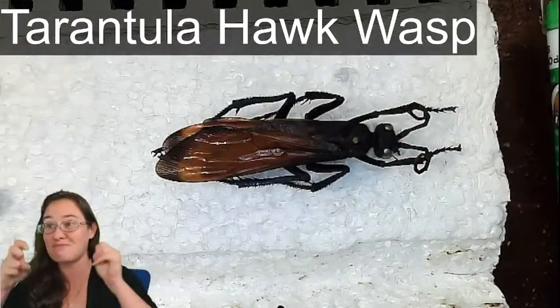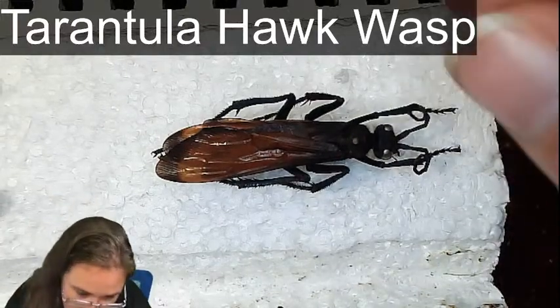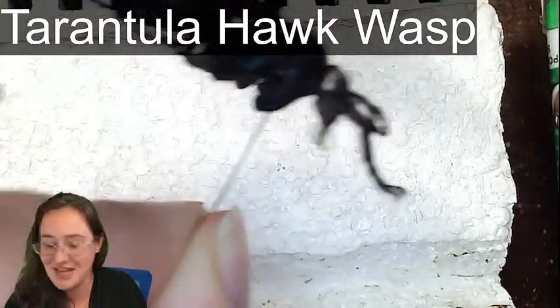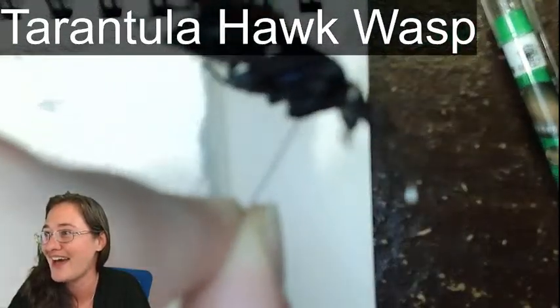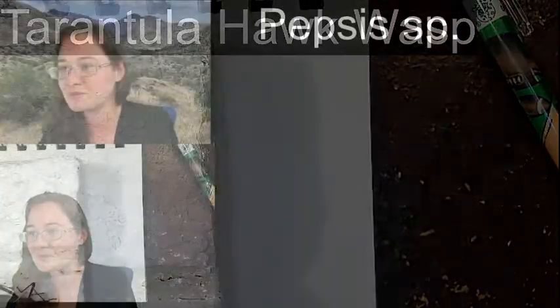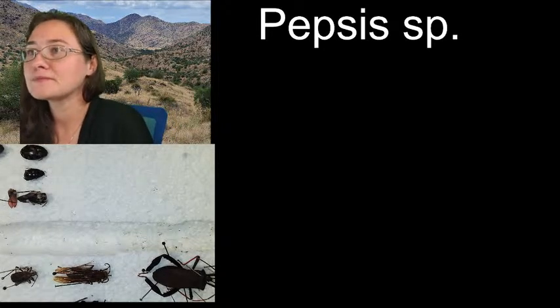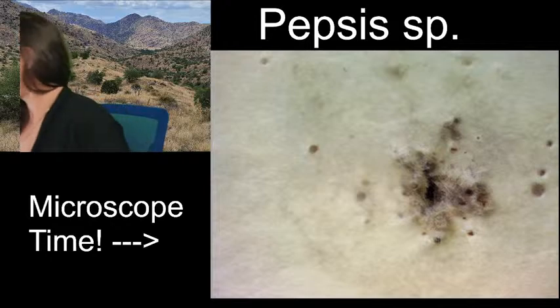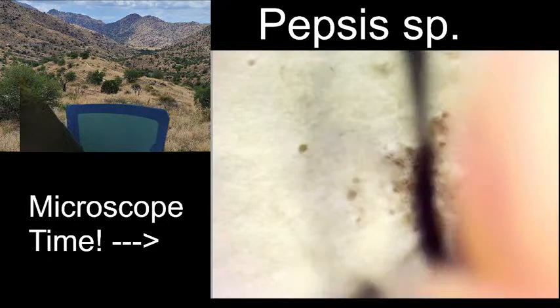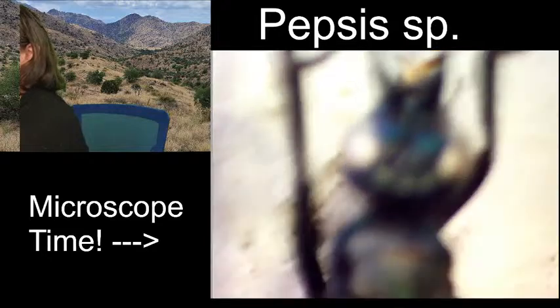Hawks, because they have really big tarsal claws, really big claws on the bottom of their feet, those claws will kind of hold on to the styrofoam. But it looks like she let go pretty easy, but ha, she's carrying a piece of styrofoam with her. See? Let go, babe. All right. Let's take her under the microscope. She did finally let go of that piece of styrofoam, too.